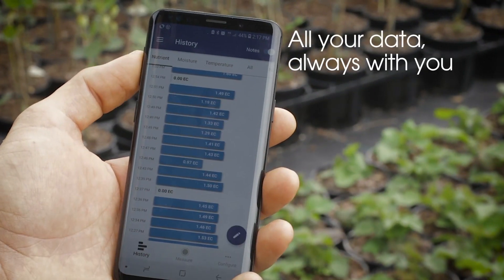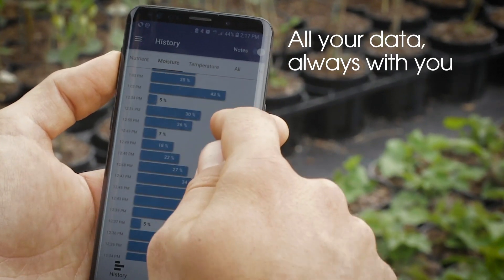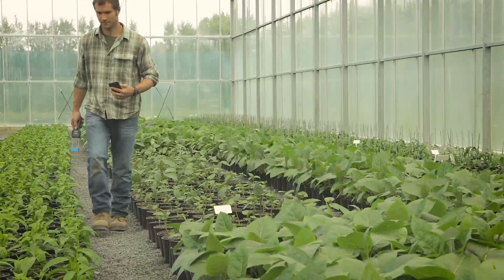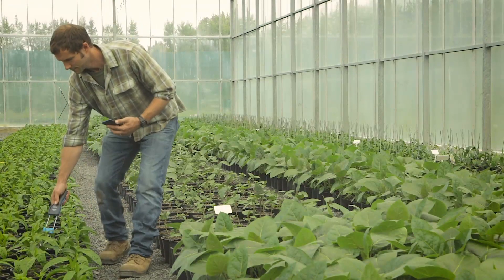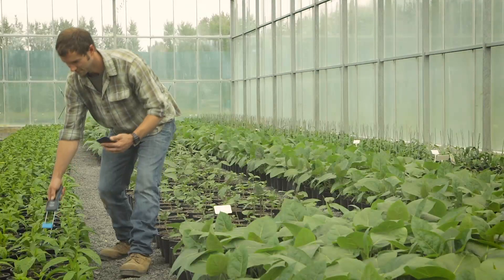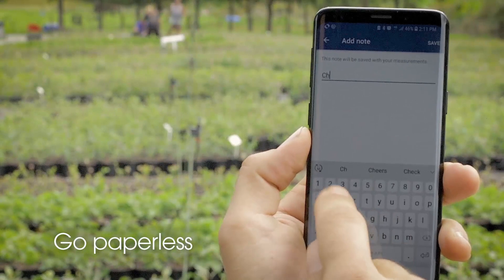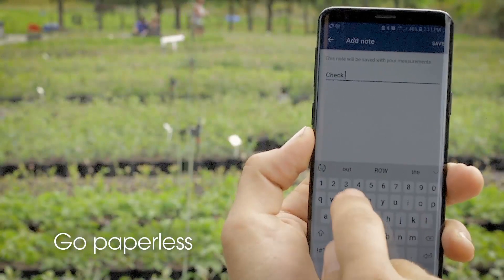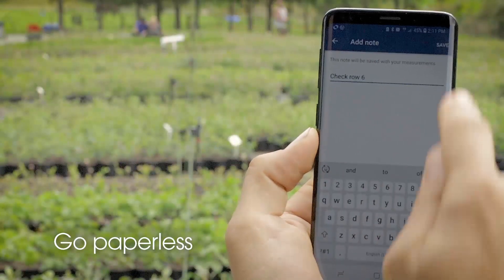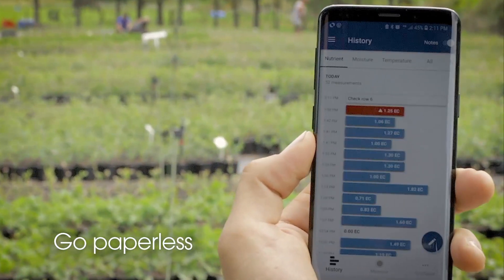Track trends across consecutive measurements at the touch of a button, and immediately review and compare measurement data in a visual form. The Pulse App is your digital clipboard — quickly make notes and record observations as you go, and view and store them directly in the Pulse App alongside the measurements.